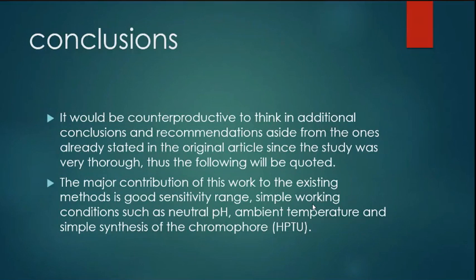And also the simple synthesis of HPTU. So HPTU, as I told you, is for doing a coordination compound. It is a ligand that will make a coordination bond with the metals, right? And so this is a chelate, and it is also a chromophore.